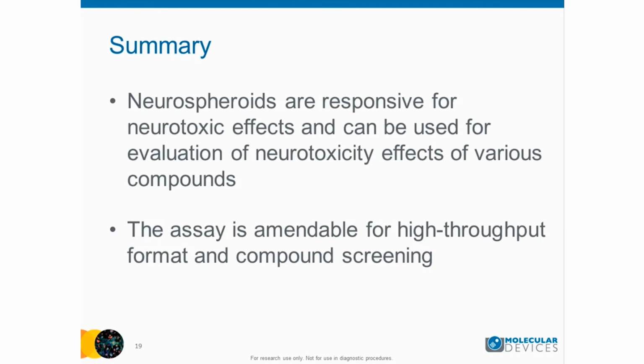So in summary, we were able to demonstrate that neurospheroids respond to neurotoxic effects and can be used for evaluation of neurotoxicity of various compounds. And it's very important that the assay is amenable to a high-throughput assay format and can enable customers to do screening of multiple compounds.